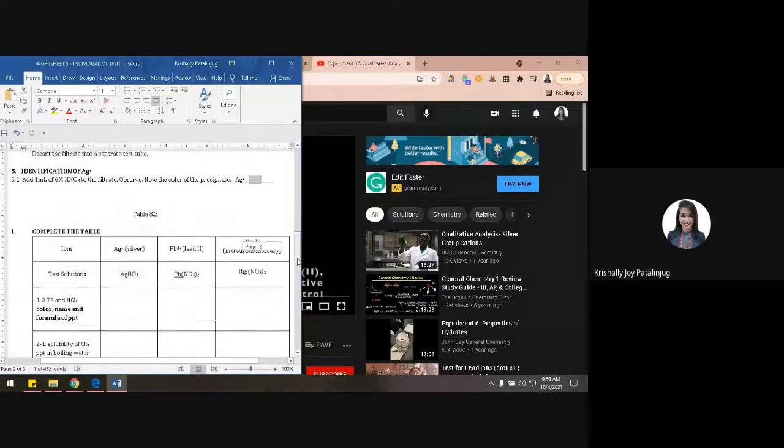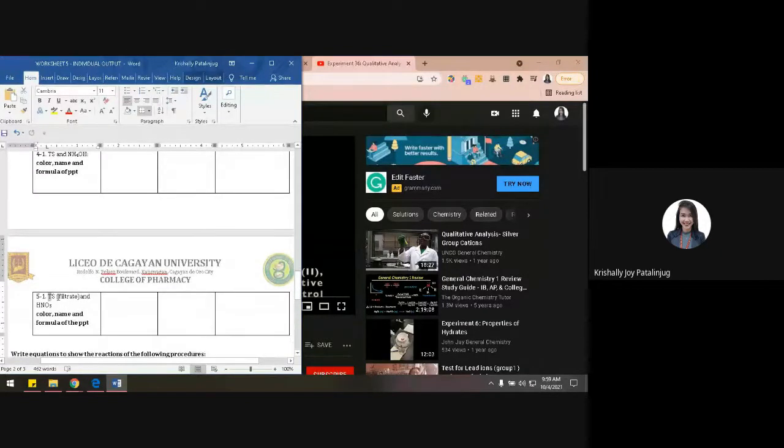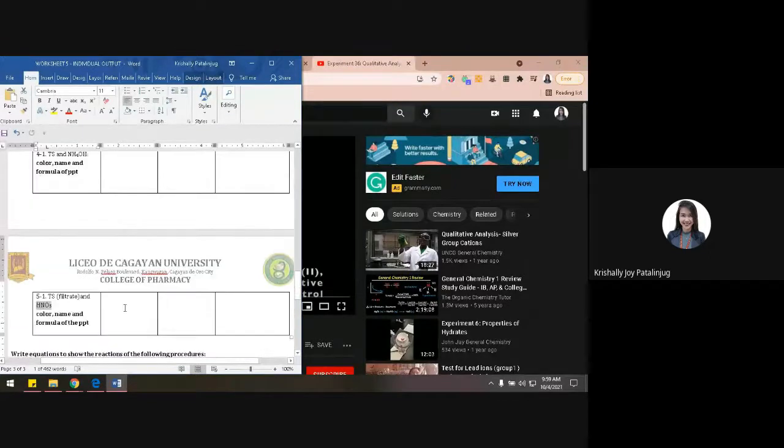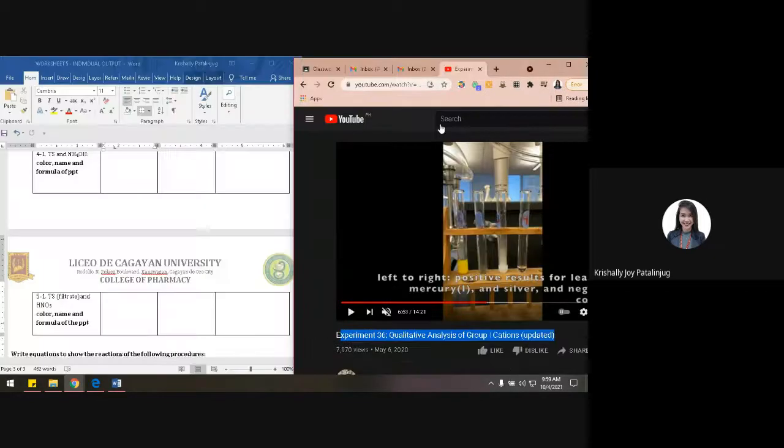Okay, sa last portion. So dito, sa last table, from the filtrate, added with nitric acid. So asa lang mag-provide og answer dito lang sa may silver column. Upon adding nitric acid, di ba, the precipitate is again silver chloride. What is the color? Oh, you know already what is the color. Okay, so ayan, di ba, this is the silver chloride. So you know already that color, ha?